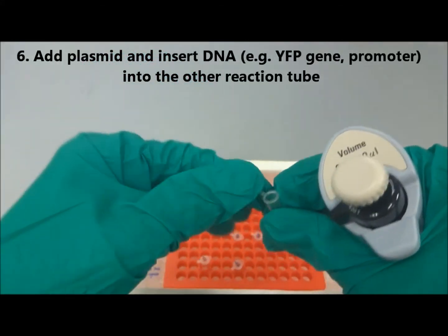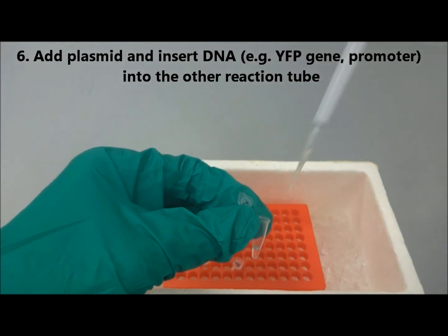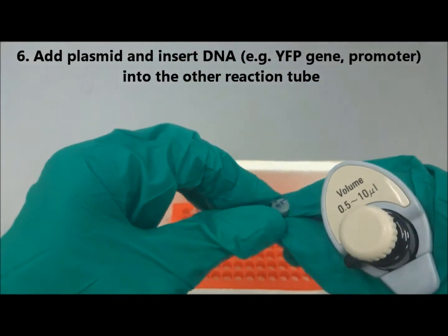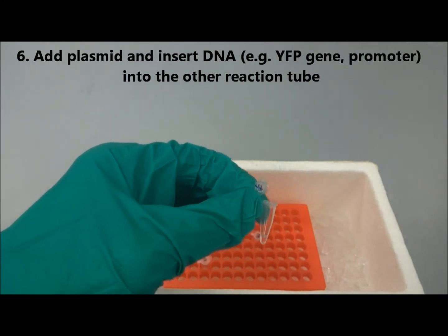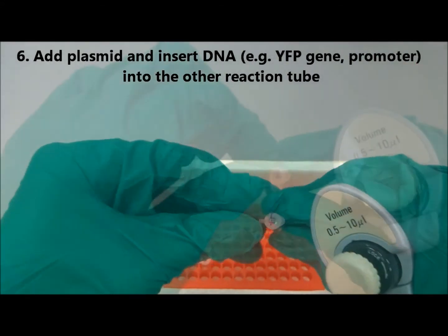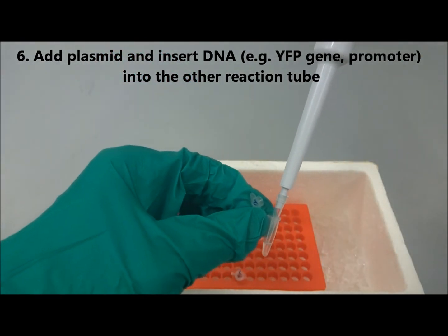Next, add all the 3 DNA components to be ligated into the other reaction tube.